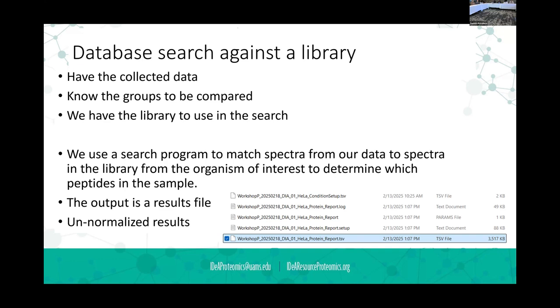The bioinformaticians are sitting around while the samples come in, are frozen, get turned into peptides, and data is collected, and they're still waiting. Finally those raw files are there, and they say, okay, now we can do a database search and start to work.